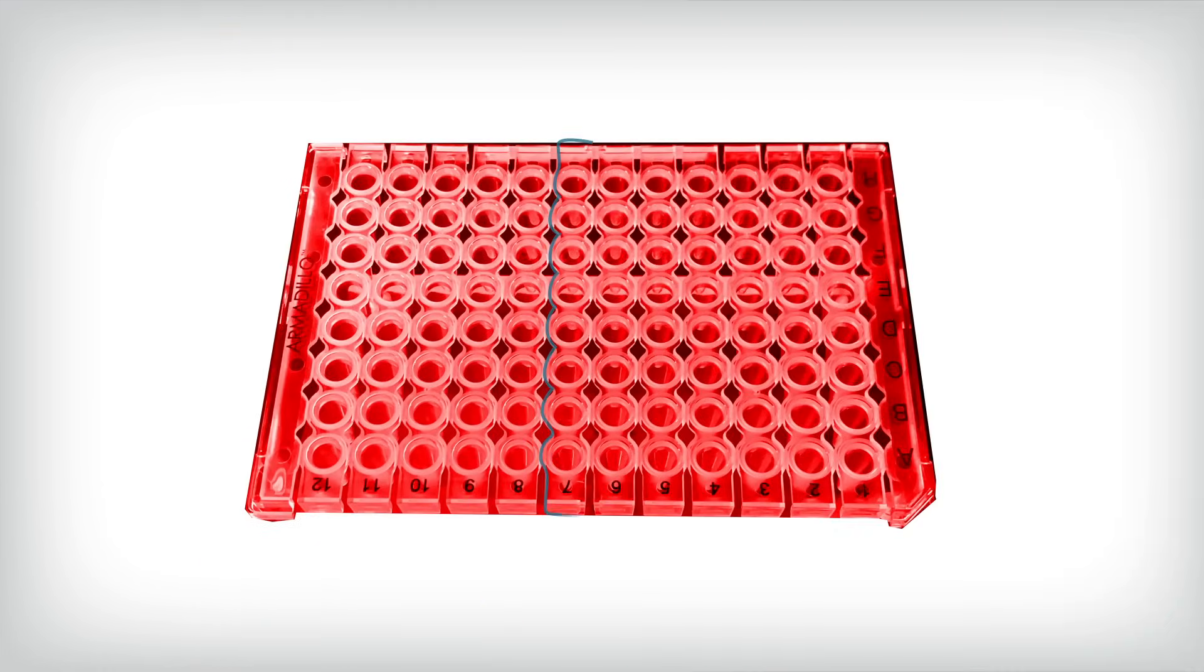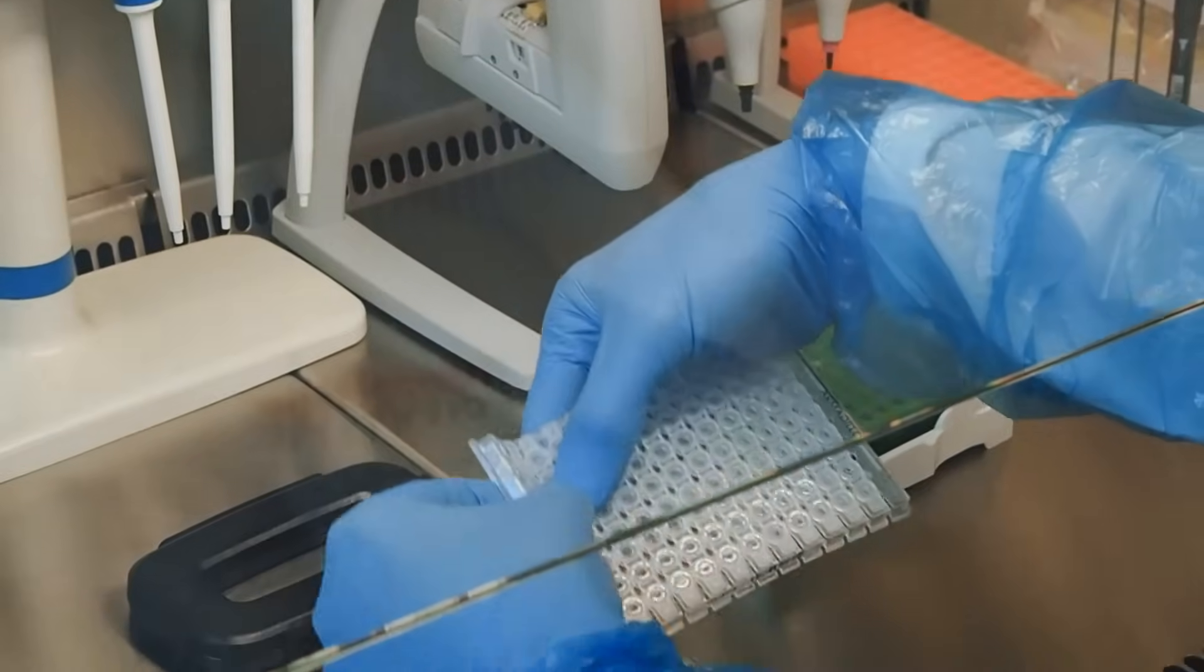For flexibility, Armadillo plates can be broken down to 8-tube strips by hand, even with gloves on.